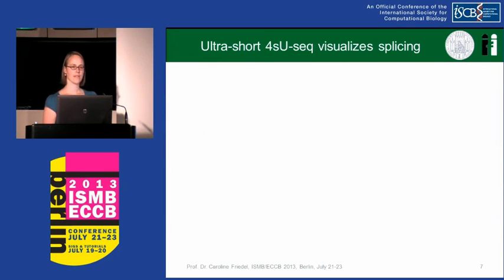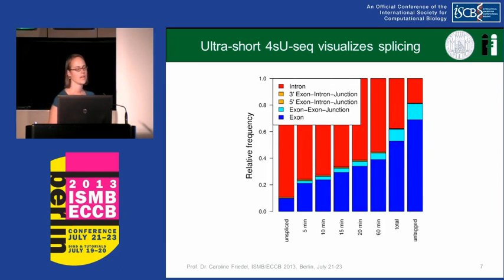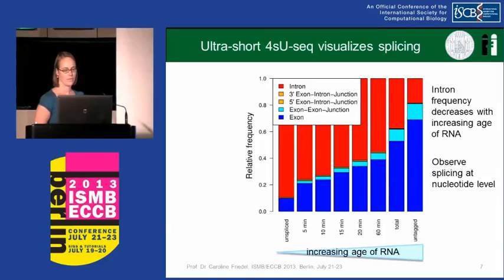And what we saw is that if we sequence these samples, we can actually visualize splicing of all the transcripts. This is the distribution of the different types of reads we get: intronic reads, exon-intron junction reads, exon-exon junction reads, and exonic reads. On the x-axis you have the duration of labeling, or the age of the RNA. As you can see, the contribution of intronic reads decreases slowly, whereas the contribution of exonic reads and exon-exon junction reads increases. So what you see is that splicing is happening, the introns are spliced out, and most of the transcripts at this time contain only exonic parts.